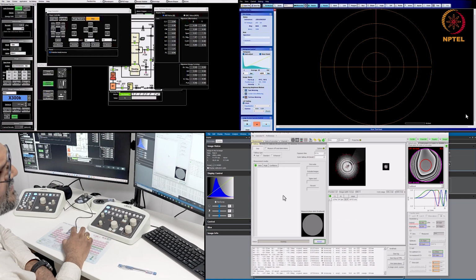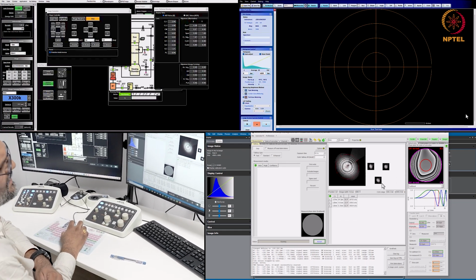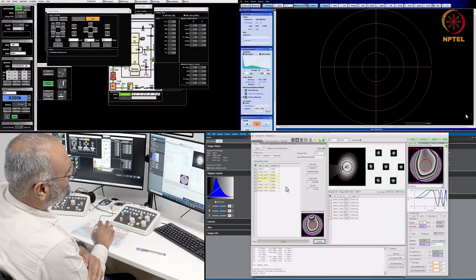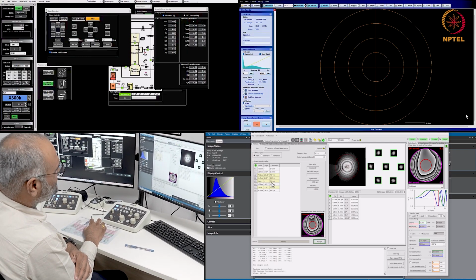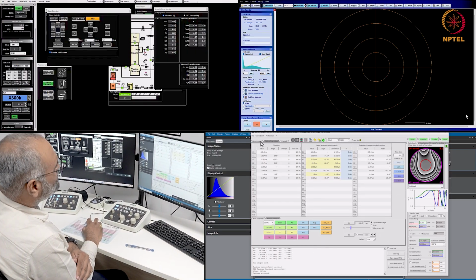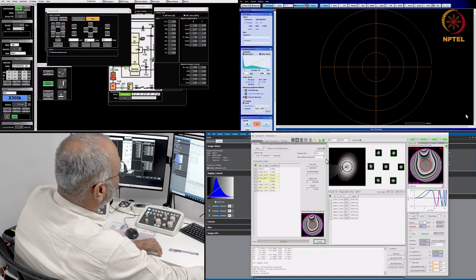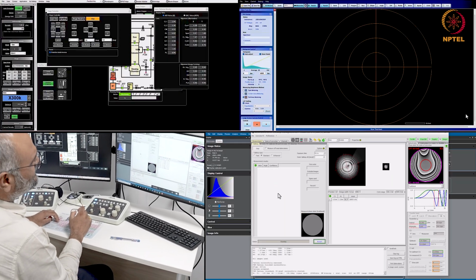I've started the tableau again. I do not see any distortion here, so I think this is in an acceptable range now. And I will accept these values for now. I'll not change any A2 or B2 right away, but instead I'll do a tableau with standard 23 milliradian tilt. And let me start here again.